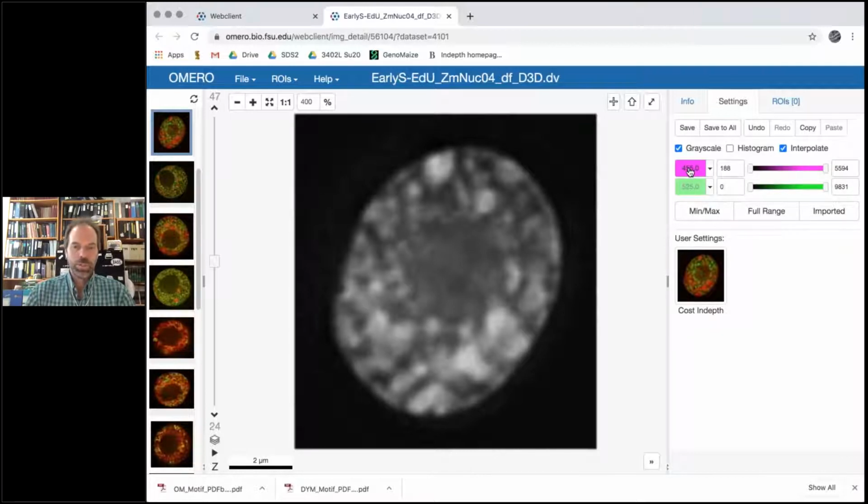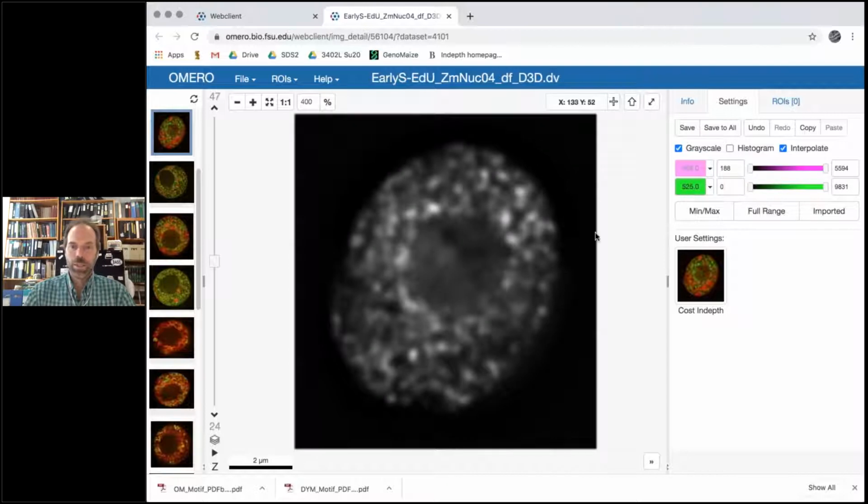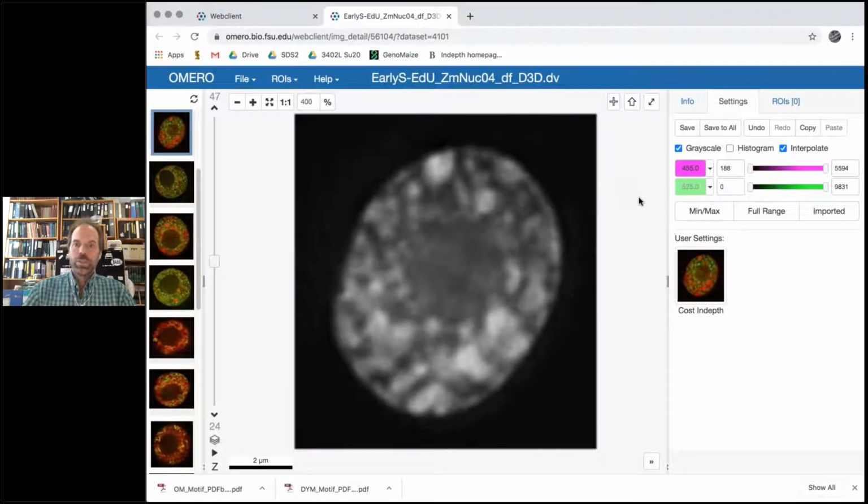So most of these images, they're all different, but these particular ones are collected as photon counts using a digital camera. So there's a DAPI image with filters for DAPI and a fluorescein image for filters for green. So in the grayscale mode, you can choose one or the other. And when you do, you can see those images. And I think it's easier to illustrate the scaling, brightness scaling here.